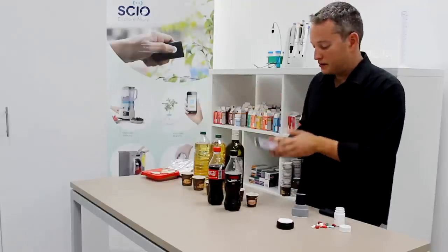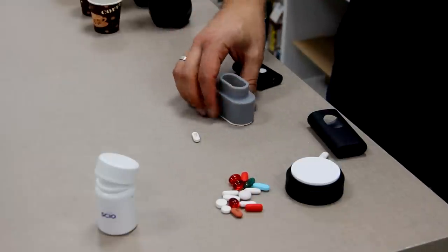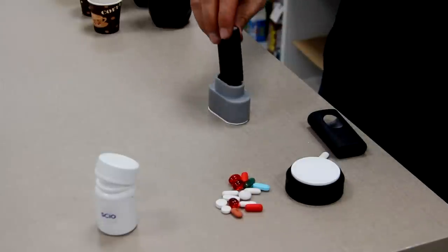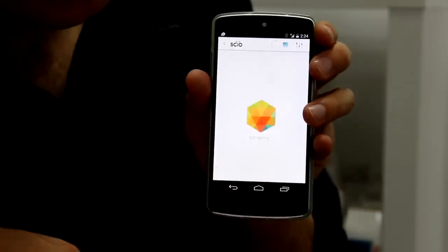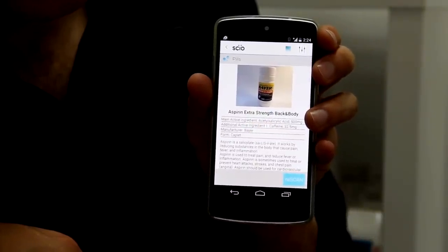Let's try the other one. I'll do the same - put the other white pill in the capsule holder, place the sensor right on top of it, and simply re-scan. So this one is a Bayer caplet.